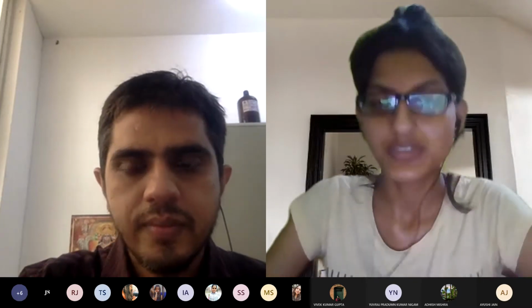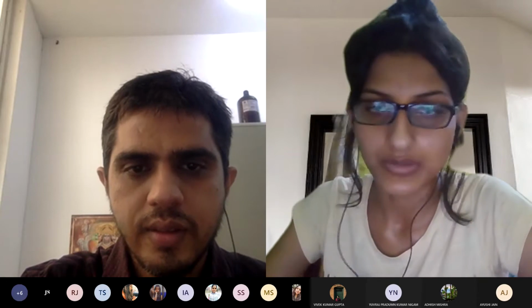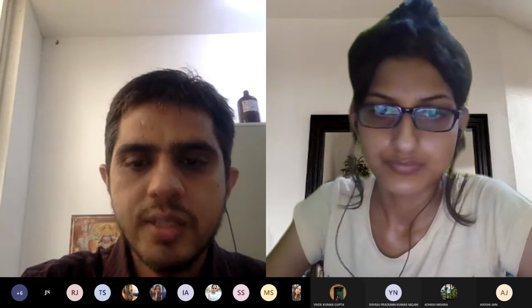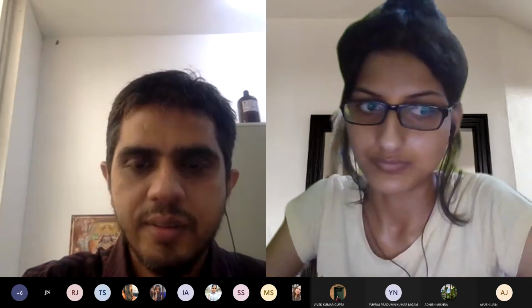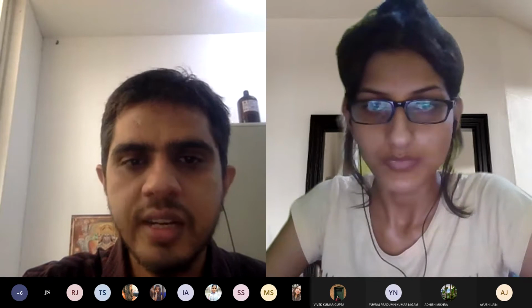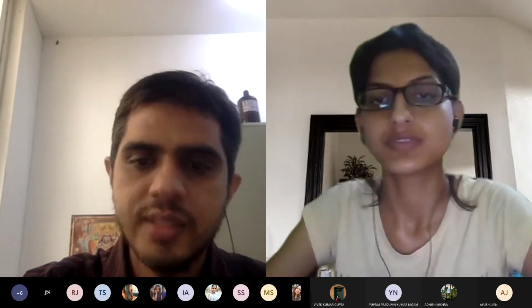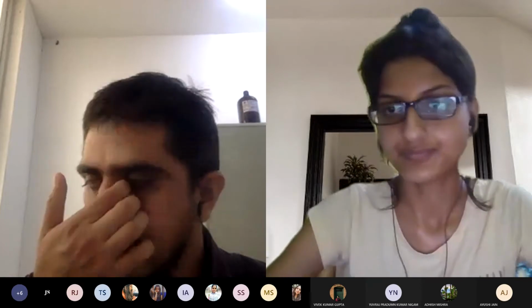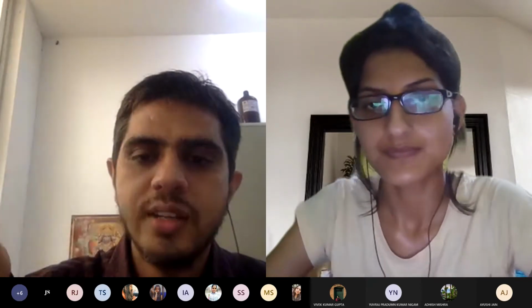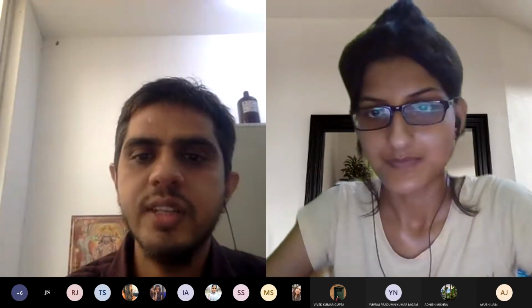Yes. Sir, my question is, is it important to have a blank test tube? Like, without it we will not be having the null reading? It is not important, it is a must. As you yourself mentioned, without this we can't get the null reading. Yes, it's true. Okay, sir. Blank is a must, because we must know what zero is, from where you have to start. If you don't know zero, then we can't say what the real value is.